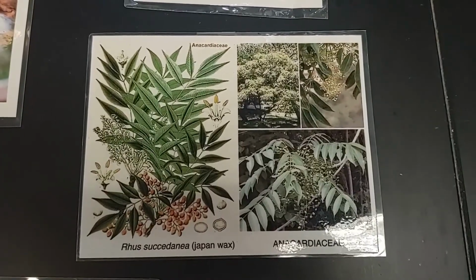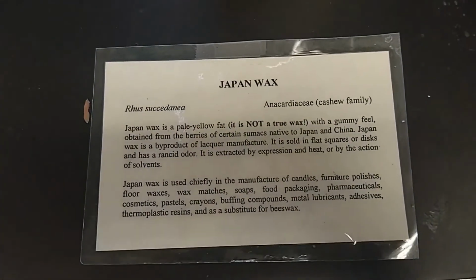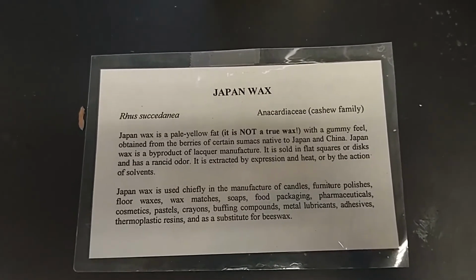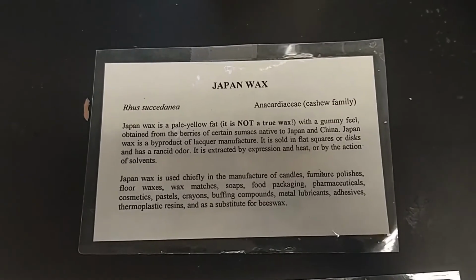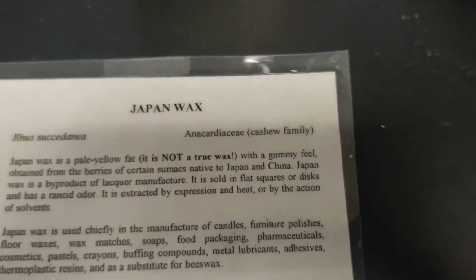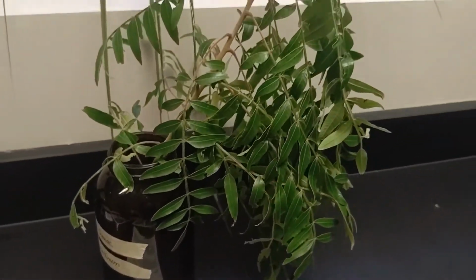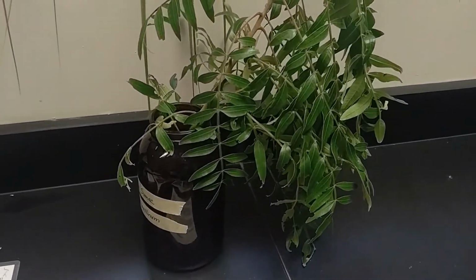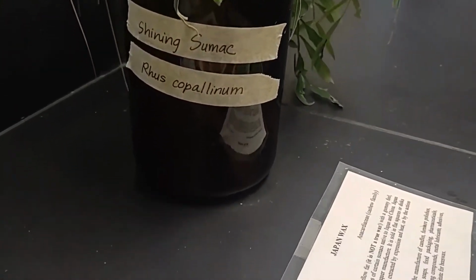Here we have something called Japan wax. And it's actually not a true wax, but has a gummy feel and can be taken from the berries of some sumacs. Anacardiaceae, which is the cashew family. This includes poison ivy as well, and sumacs. So sumacs can give you an allergic reaction if you are sensitive to this particular plant.